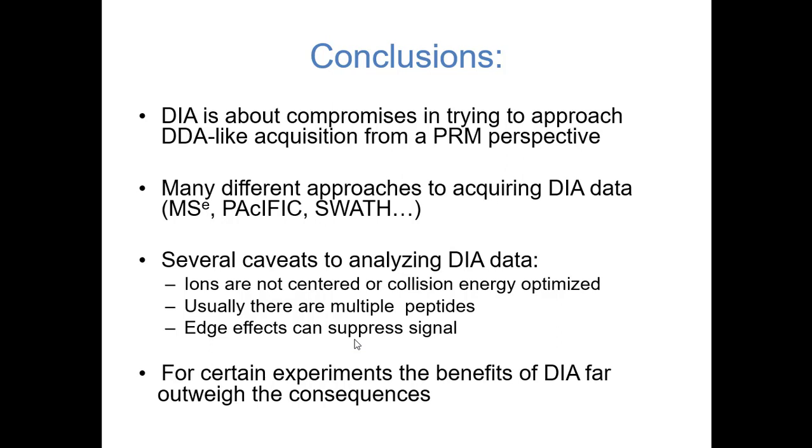You label all your peptides with a bunch of labels, and the same kind of problem that we have here is a problem for iTRAQ. When you acquire an iTRAQ peptide, you do a precursor isolation window around that peptide, 2 m/z or so. There's going to be that one peptide, and it's going to produce reporter ions, but there's going to be a bunch of other peptides in there.